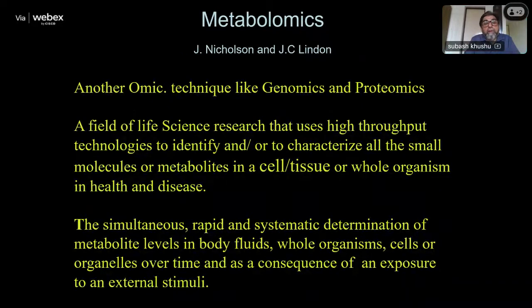The term metabolomics was coined by Nicholson and Lindon, and this is another omic technique like genomics and proteomics. It's a field of life science research that uses high throughput technologies to identify or characterize all the small molecules or metabolites in a cell, tissue, or whole organism in health and disease.